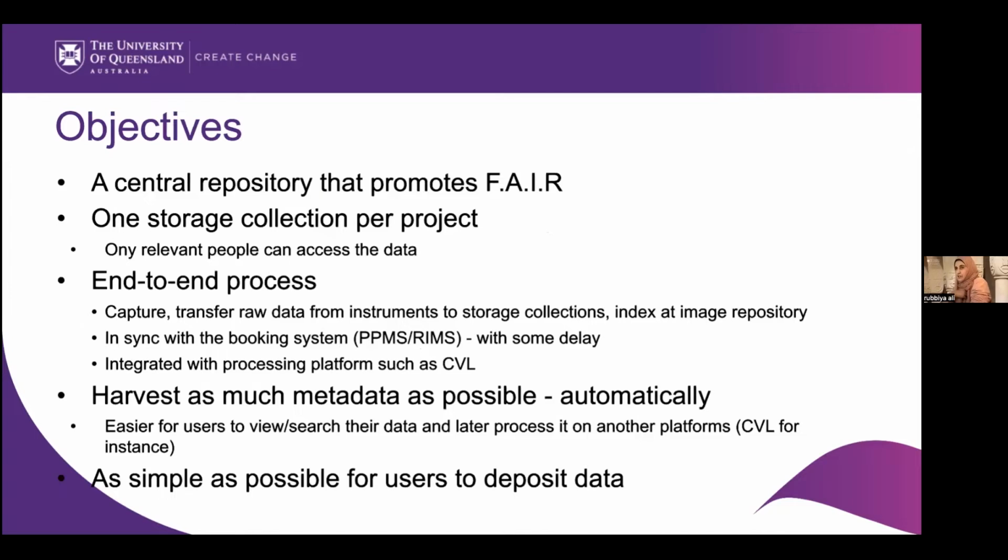Okay, so the objectives. We defined the objectives for this project. We were trying to establish a central repository, and the aim was to promote the FAIR data principles, which stand for findable, accessible, interoperable, and reusable data. Before Pitschi started, as I mentioned, we used to have instrument-based collections, and anyone who had access to the instrument could access that data.